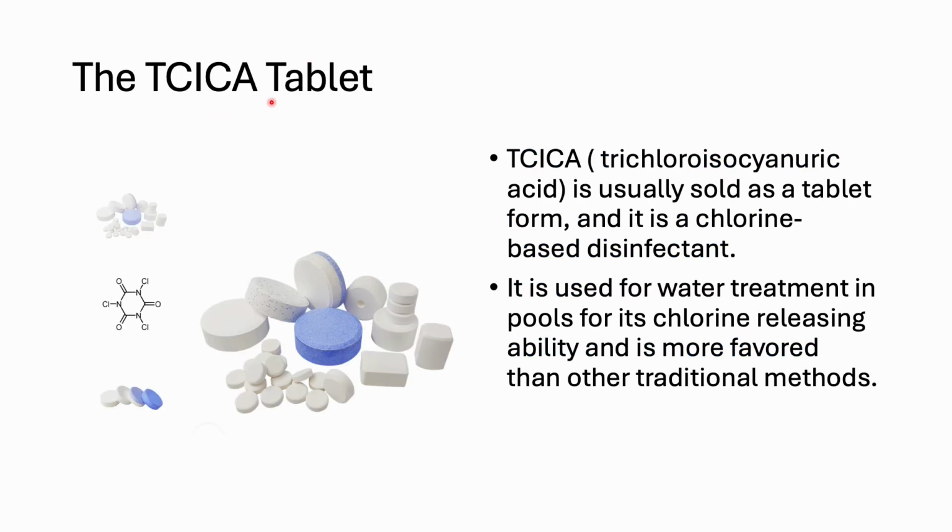The TCICA tablet, also known as trichloroisocyanuric acid, is a chlorine-based disinfectant used widely for water treatment in swimming pools. This compound is usually available in the form of tablets, as shown here, and releases chlorine to sanitize water and control algae and bacterial growth in swimming pools. These tablets are usually preferred over other traditional chlorine sources because of their extended disinfecting effects, ease of handling, and high stability.